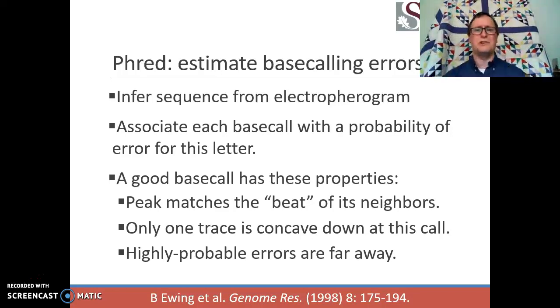There's not a chance you want to put an offer down on this house. Well, in the same way, when we look at base calls for a particular electropherogram, if you're right next door to a base call that's highly in doubt, it's probably going to cast a pretty big shadow on these neighboring nucleotides as well. So being farther away from them gives us greater confidence that this probable error over here is not going to impact this peak that's some distance away from it.